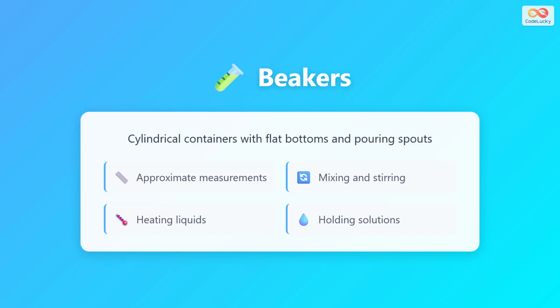You can also heat liquids in beakers, and their wide opening makes them convenient for holding solutions during experiments. While beakers have volume markings on the side, remember that these are only approximate measurements, not precise ones.